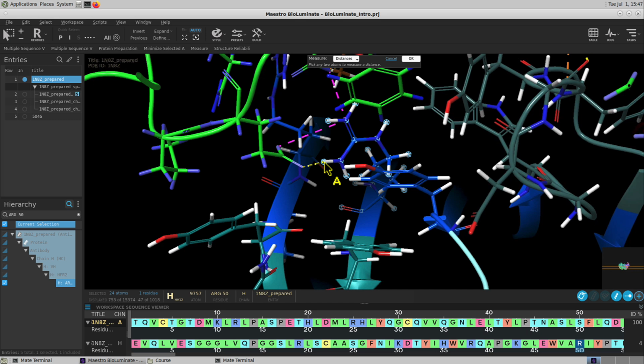Now click on the two atoms that form the hydrogen bond to define the distance. Remember, the hydrogen bond is shown with a yellow dashed line. You can use your predictive highlighting to let you know what you're going to click before you click on it. After you select both atoms, the measurement appears in the workspace, and the measurement toggle becomes active. Pause here until you can see the measurement. Once you can see the measurement in the workspace, click OK to close the measurement pane.